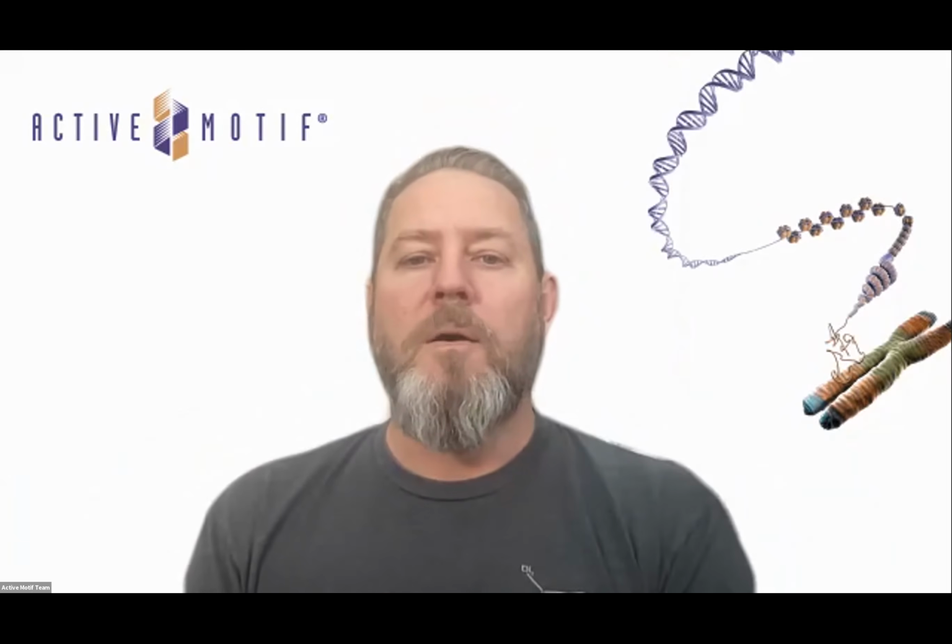I believe this is the same viewer. When doing CUT&RUN, the beads are heavily aggregated. How can they improve this, and does it affect the results? I have some ideas, Sarantis, but feel free, Mason, please.